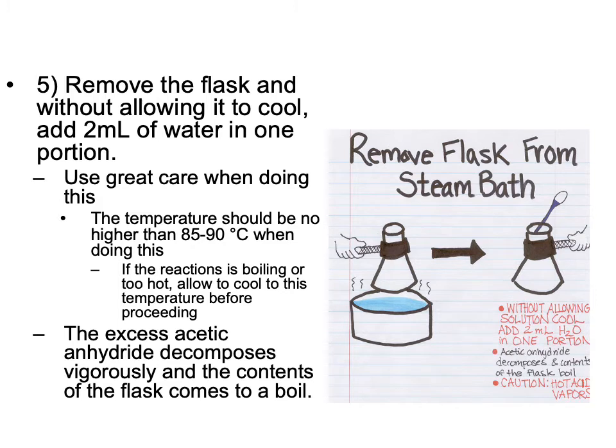So you need to remove the flask, and very quickly you need to add 2 milliliters of water. Use great care when doing this because it's hot, and if you are not careful it may cause issues. And then the excess acetic anhydride decomposes vigorously and the content of the flask comes to a boil.